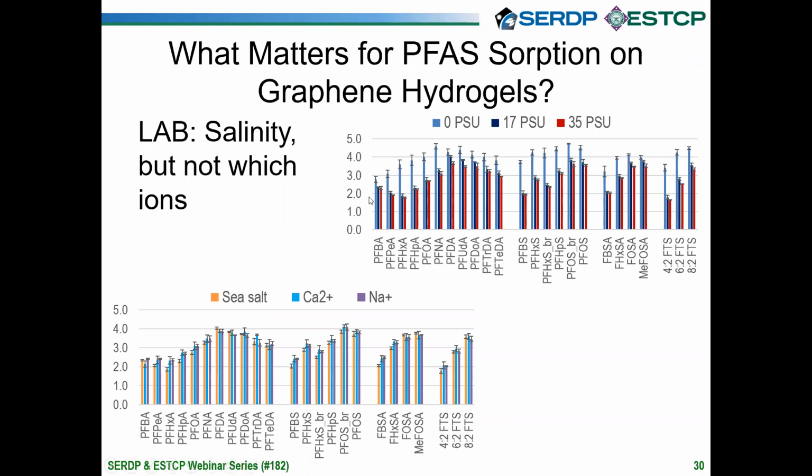And you see the sampler works really well in fresh water, but once we have ions present, saltwater ions, then we start having a problem. And the accumulation on the nanographene drops by almost an order of magnitude. We then also checked whether this depended on whether the cations were monovalent or bivalent. That didn't make a difference. So, all right, first note here, fresh water is easier to work in than salt water.